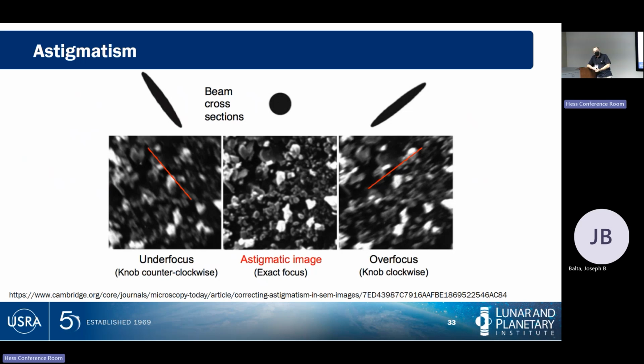On ours, it's forgiving enough that this setting does exist, but we typically don't have to adjust it. That is not the case on every electron microscope I've used. I would say that getting this right is one of the more complicated things to figure out on an electron microscope, because you're not just having to focus, you're having to focus and then go out of focus, adjust the direction in which it's out of focus, and then bring it back into focus.